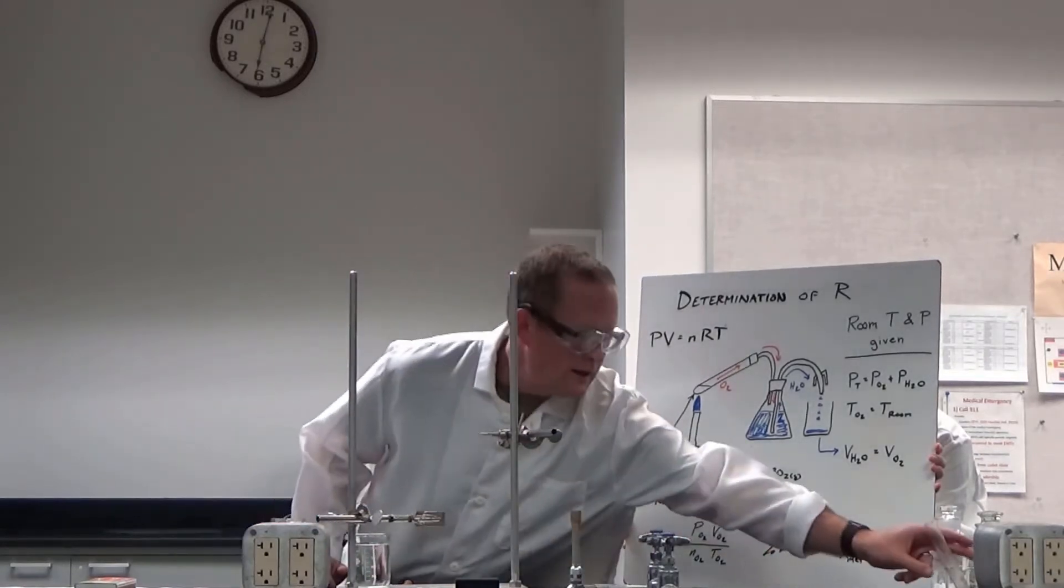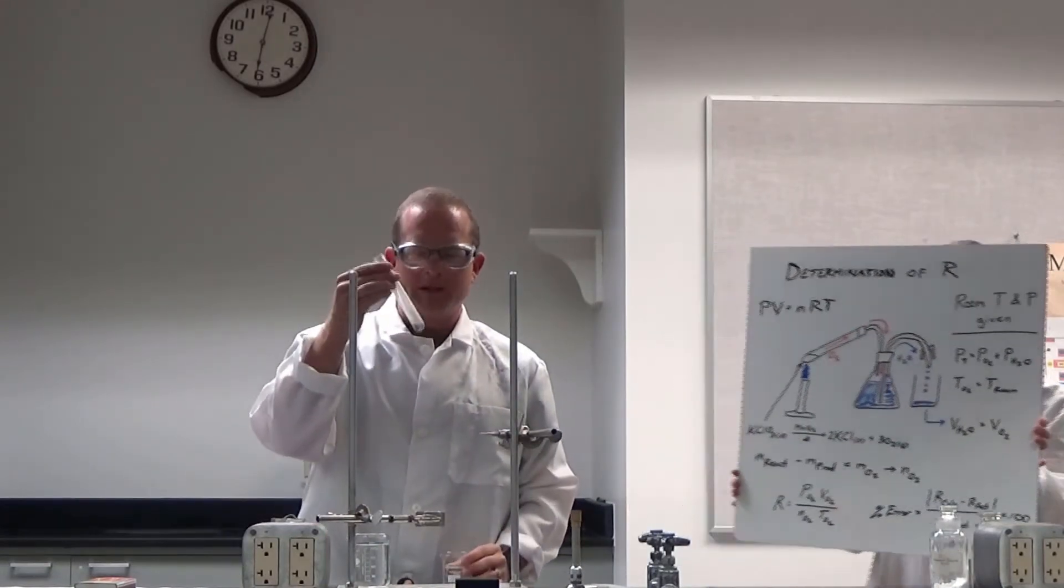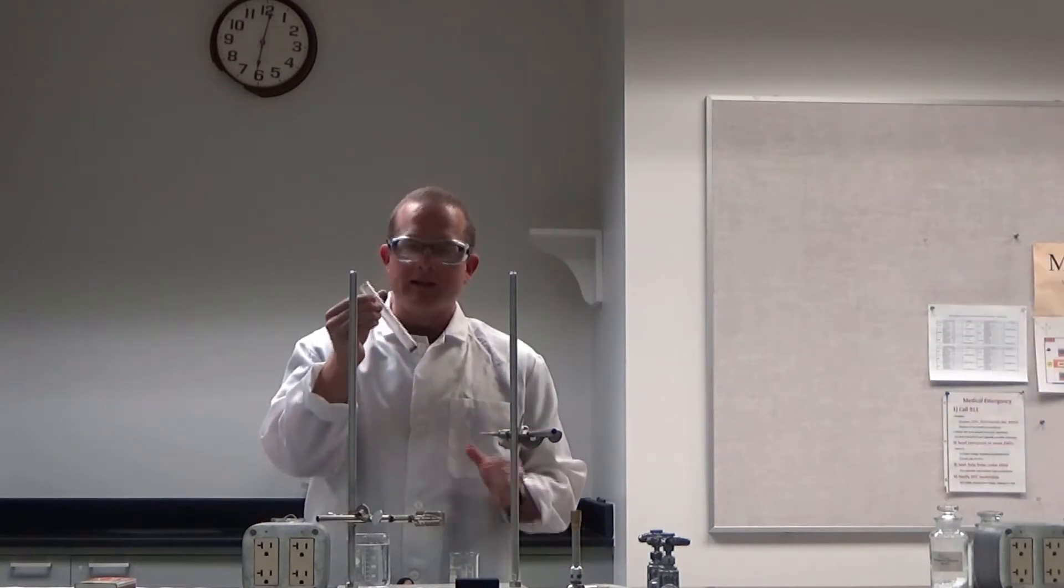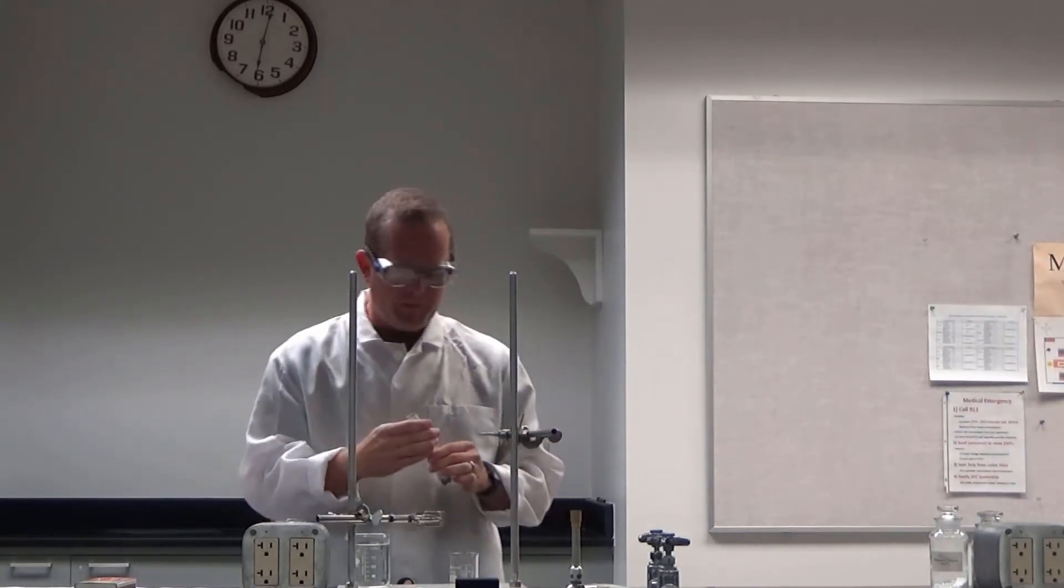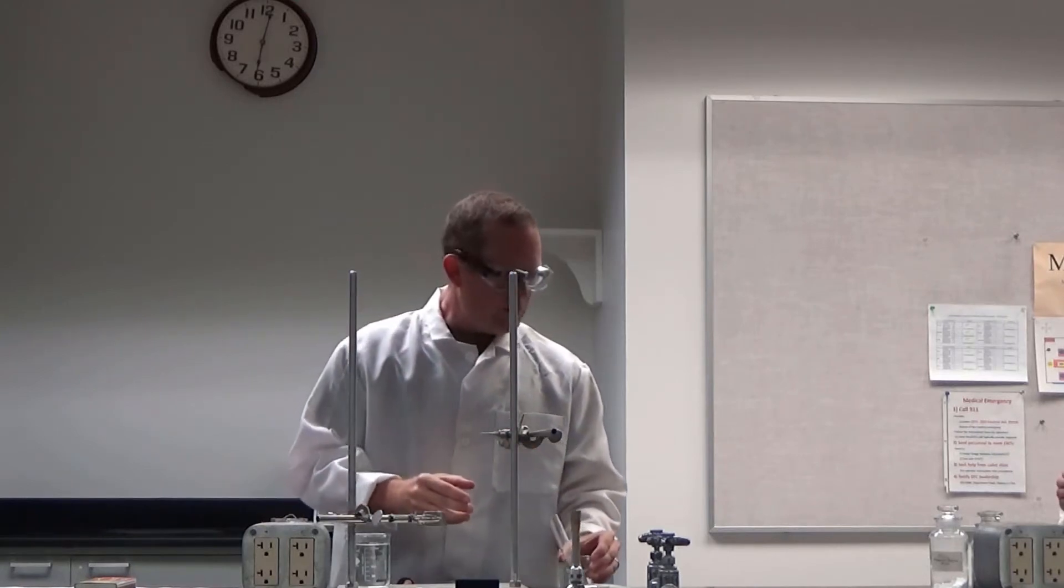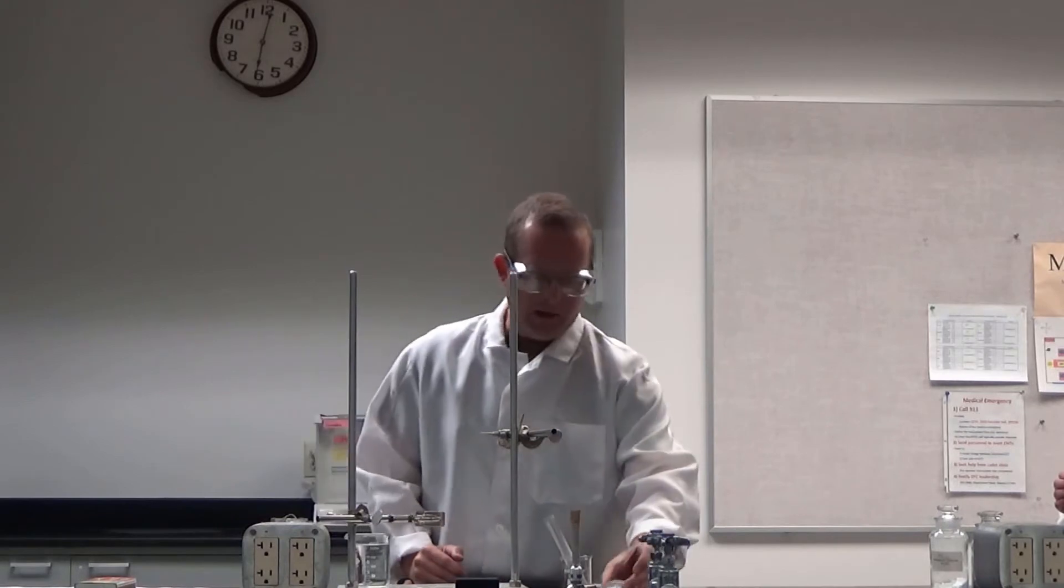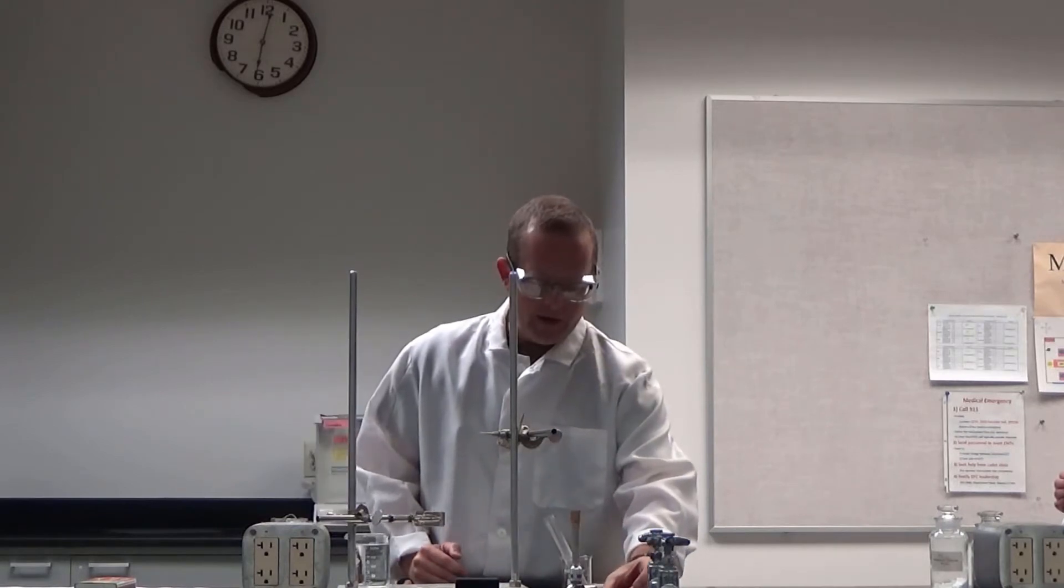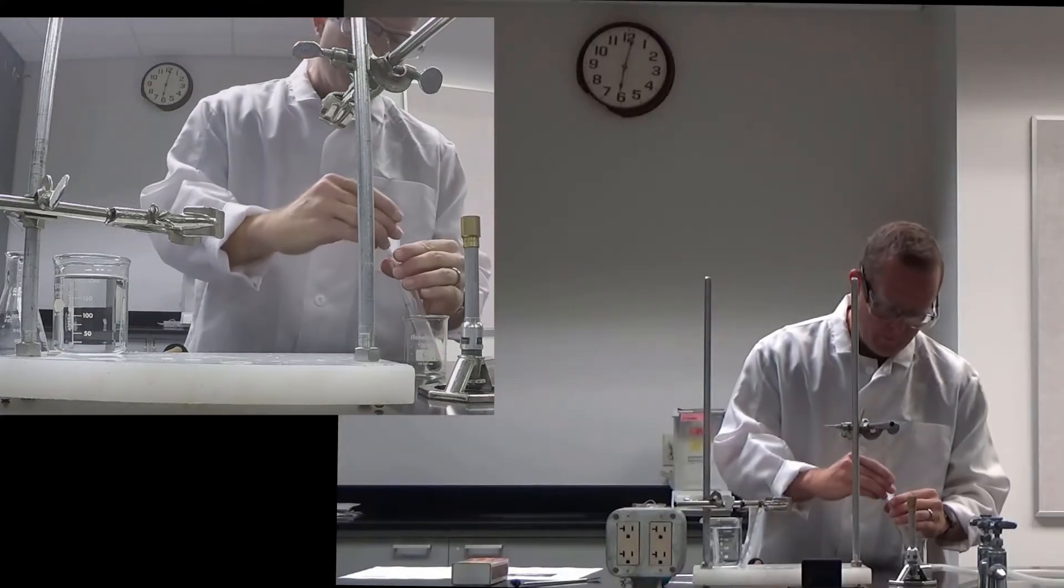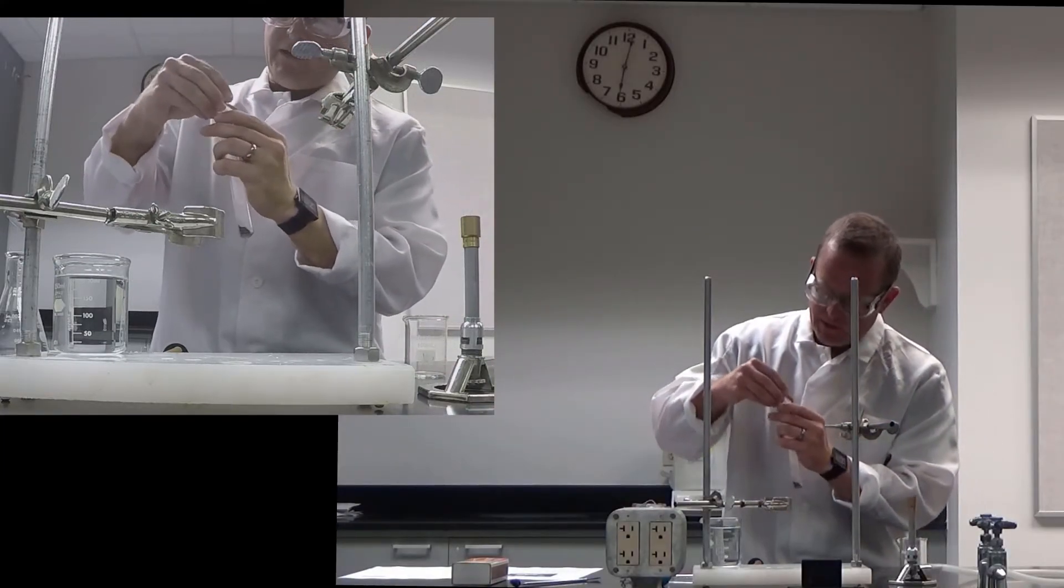So first we have our ignition tube, which looks just like a test tube, but it's much thicker, and it's designed to withstand high temperatures. So here's our ignition tube. To that ignition tube, we'll add about 0.35 grams of potassium chlorate. This looks like a white powder. So we'll dump that in there.